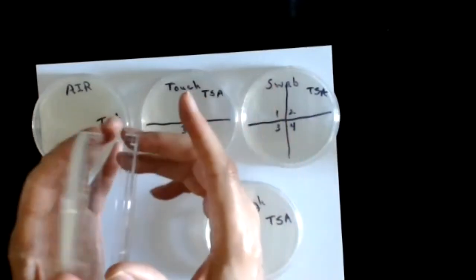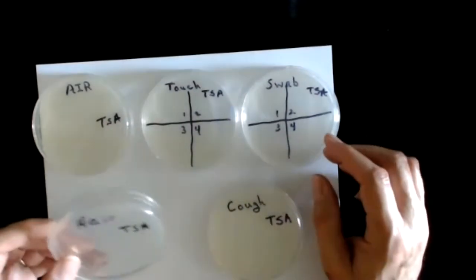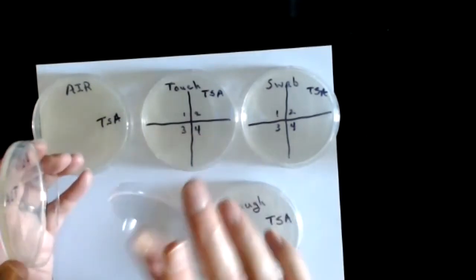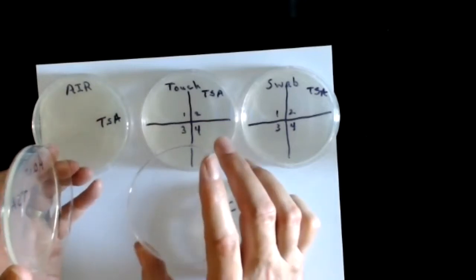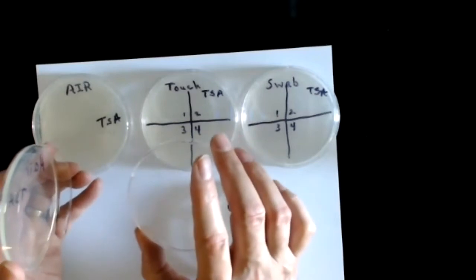This is important. Whenever you mark plates, whenever you label plates with information, you never, ever, no, never mark the information on the top. Because if you remove the top from 2 or more plates simultaneously, it's possible you could put the wrong top back onto the wrong plate.